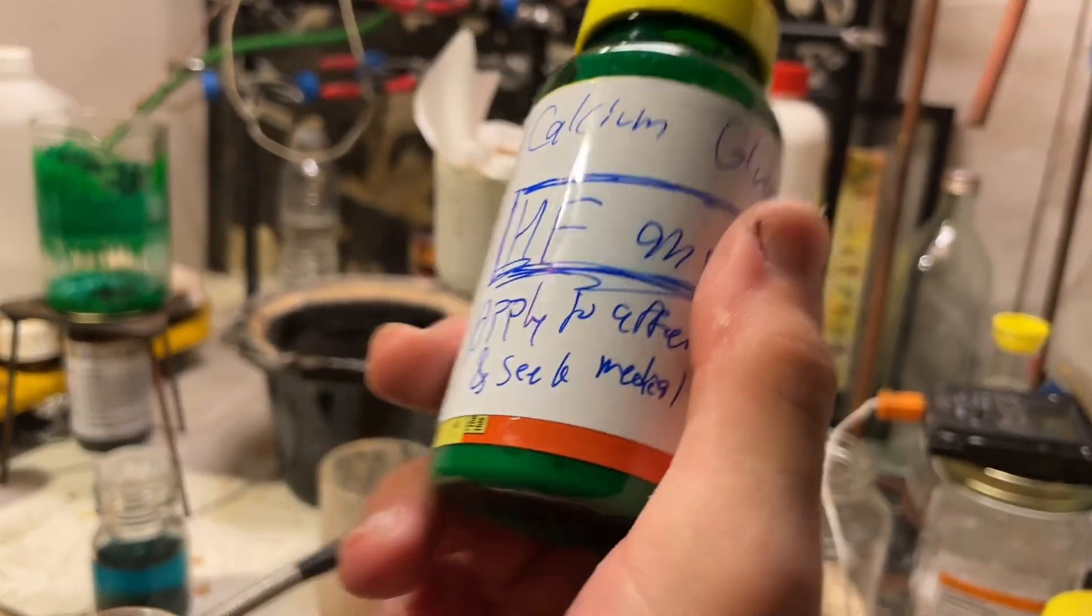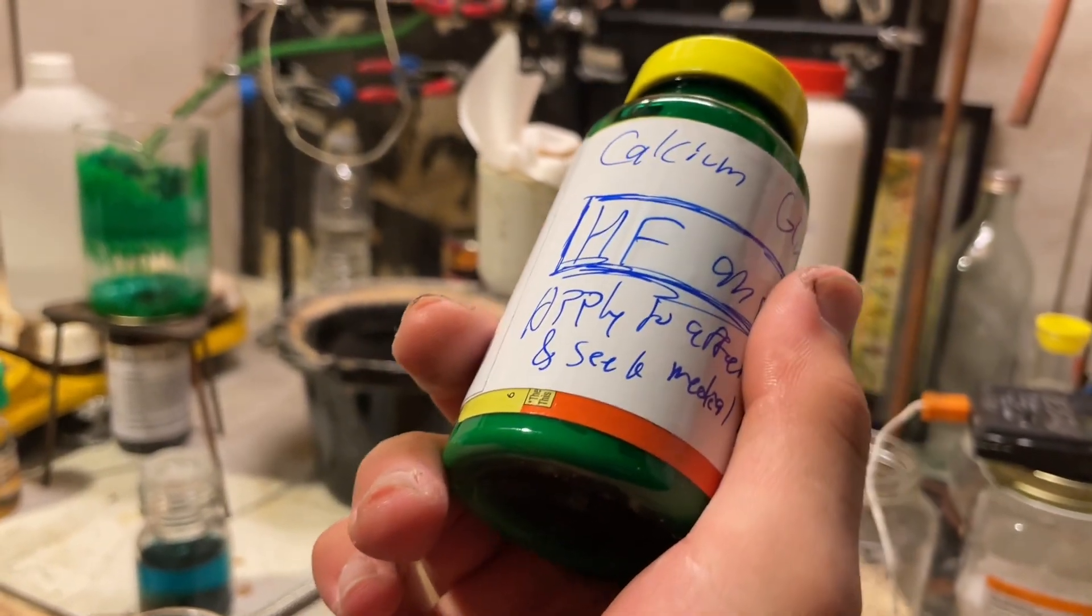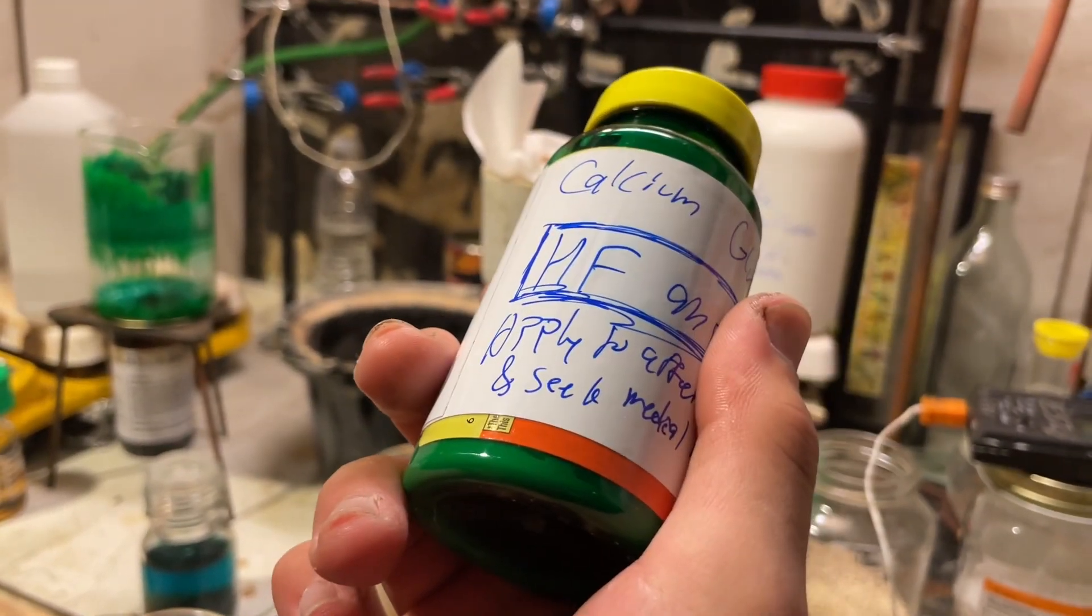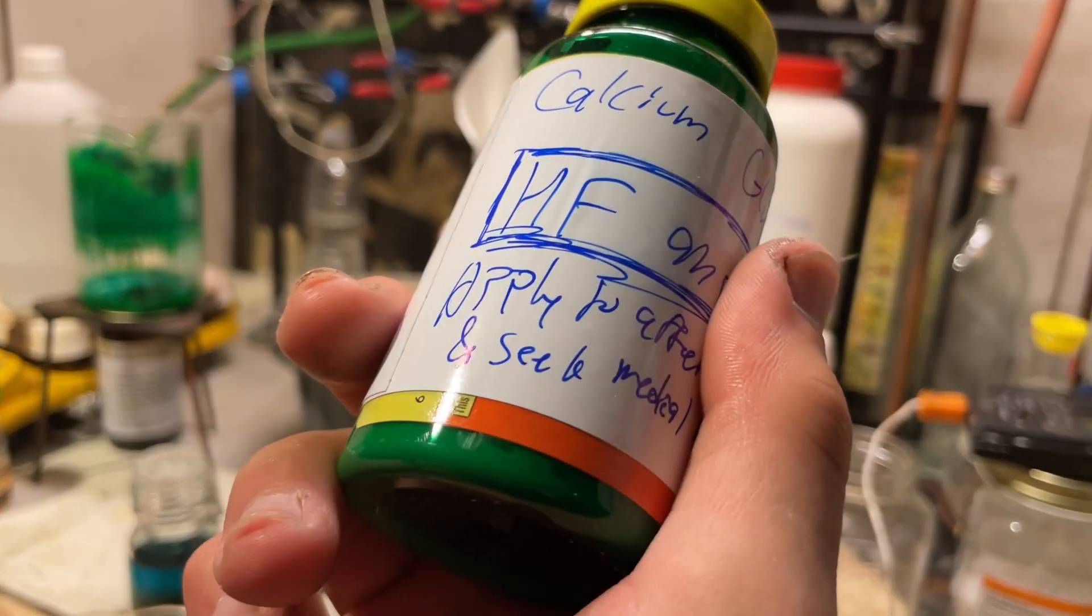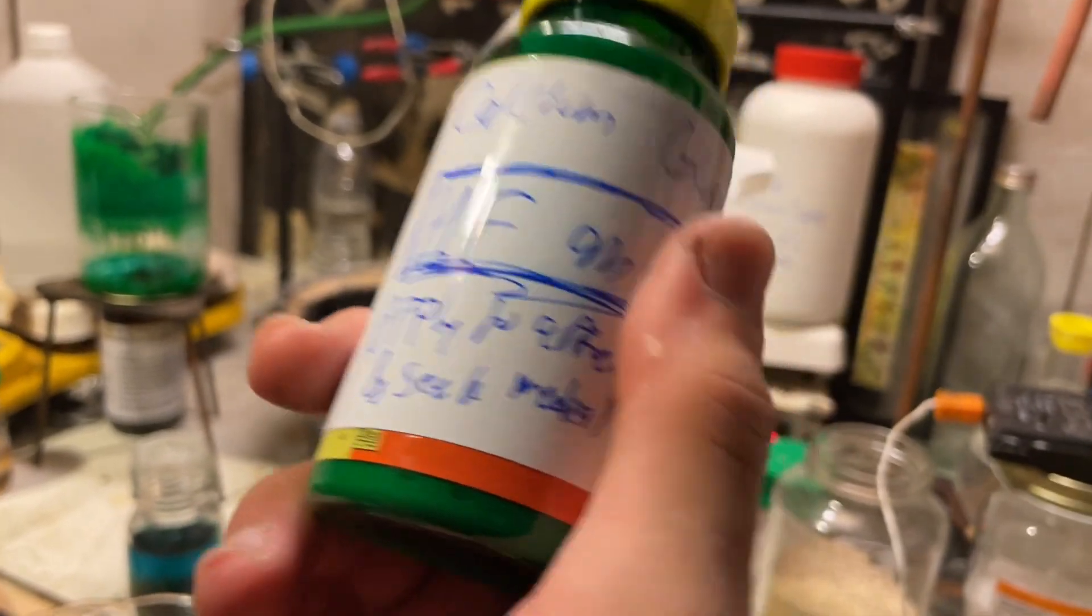They're all just carboxymethylcellulose, 2.5% calcium gluconate, water, and some kind of preservative like sodium benzoate or methylparaben. You want to know what this is? I don't even need to use carboxymethylcellulose because calcium gluconate has low solubility in water.